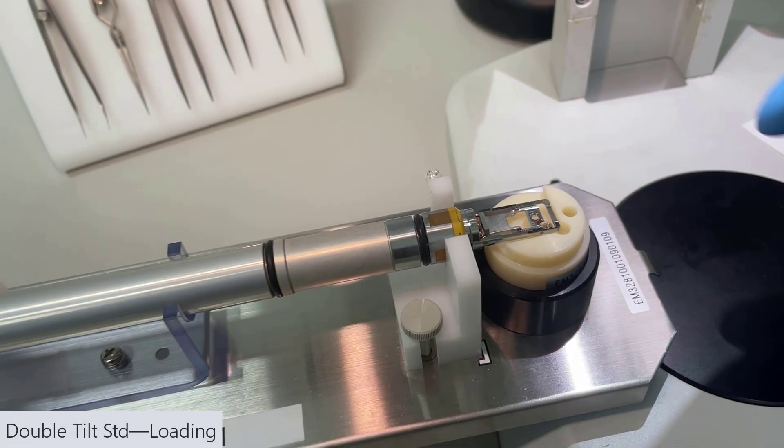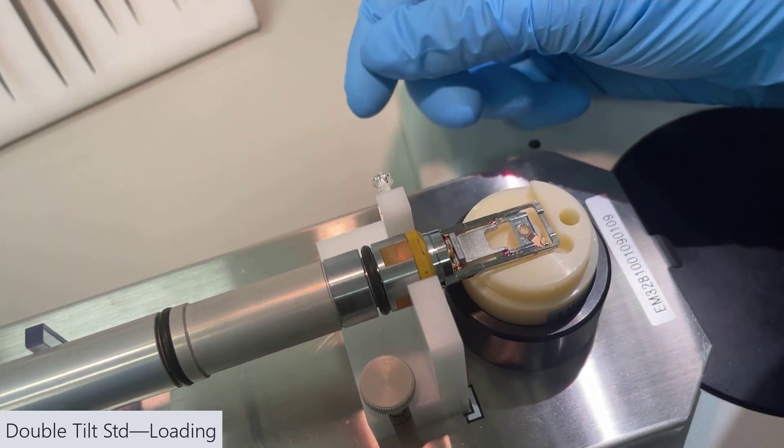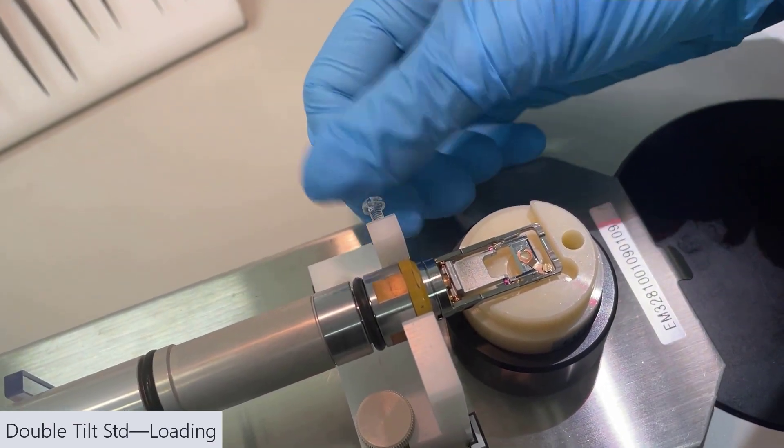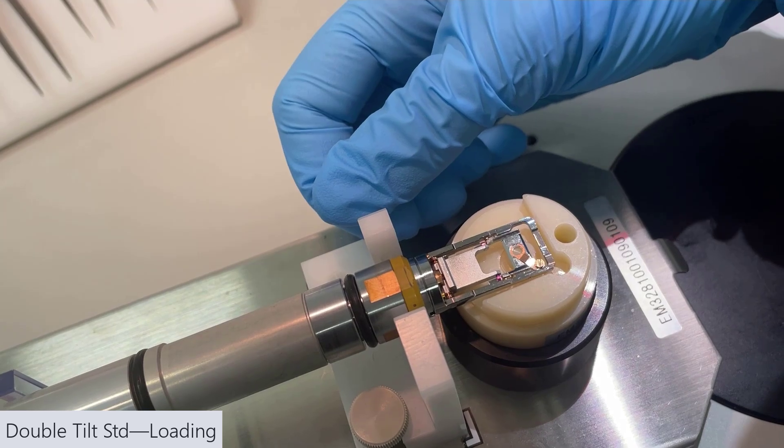Now let's talk about our double tilt standard holder. This is good to use for something like diffraction where you need to tilt in both X and Y. With our double tilt holders, we have the ability to lock the holder with a screw, and if you have that ability, I highly recommend it.